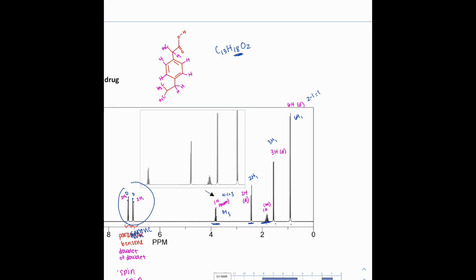And if you're given the structure and the implicit hydrogens aren't drawn out, I think it's very helpful to draw them out, because just because they don't show up in the structure, they are going to be in that proton NMR. So anyways, moving back, we determined that one.